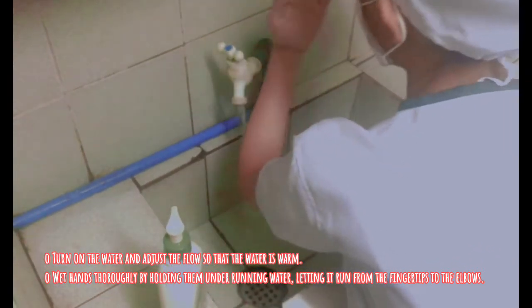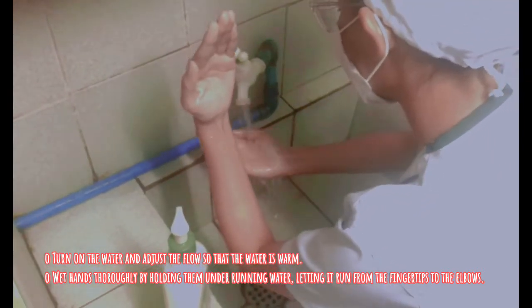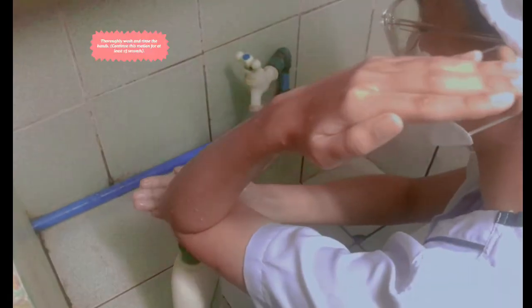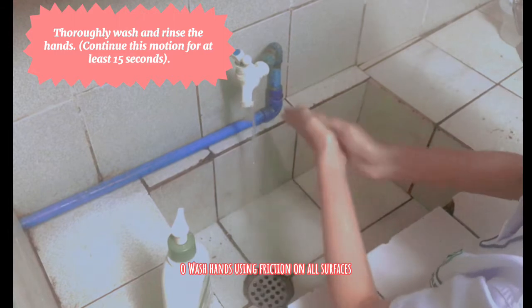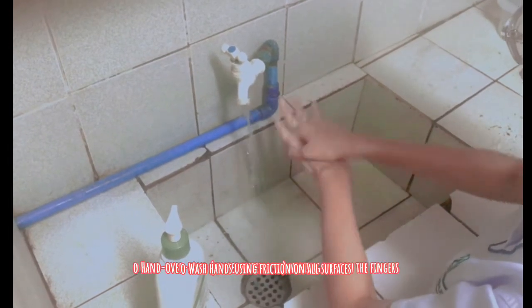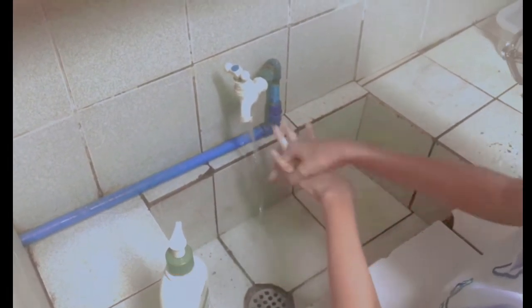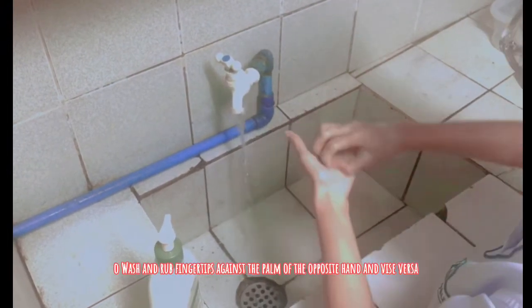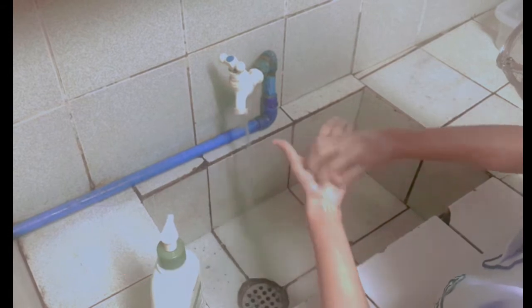back towards you. Holding the hands higher than the elbows during this hand wash maintains the principle of asepsis and from area with lesser microorganisms to more microorganisms. Using the friction or rubbing motion facilitates the removal of microorganisms mechanically, and by using different hand washing techniques, it ensures all surfaces of the hands, palms, and wrists are clean.